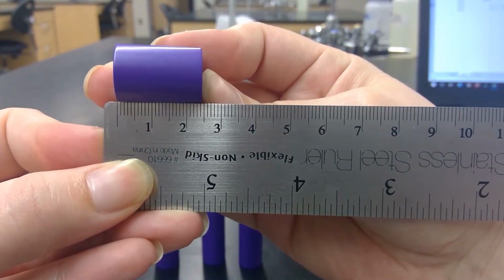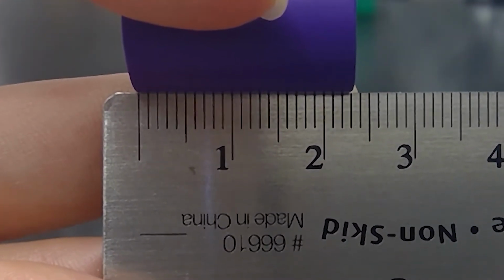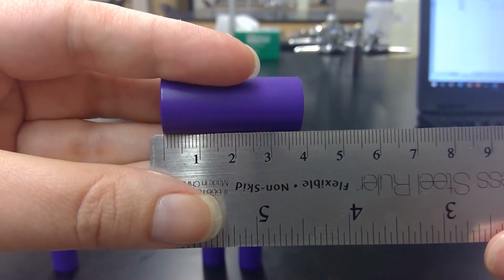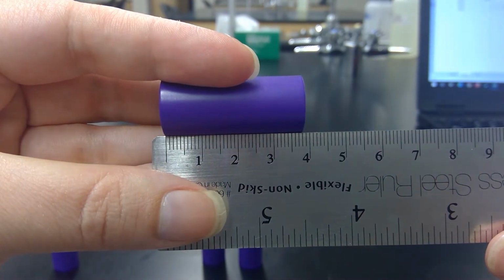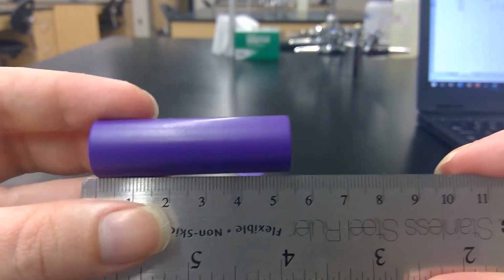All right, so record your data. This is the second to smallest one. All right, record the length. This is the third one.